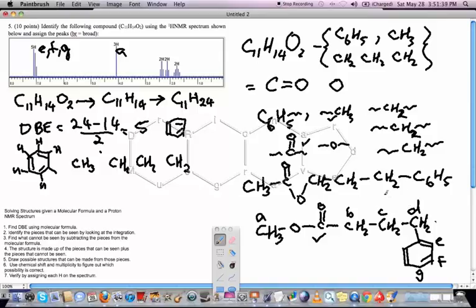Now we've just got to figure out these guys here. Now what I like to do is, when I'm looking at these, I will often figure out what's going on with the multiplicity. So we look at the C, and we see that this C, CH2 here, has, it's going to be this one here, because this has 5 peaks, and it's got 4 adjacent hydrogens. So this one's going to be C. And the other two are going to be B and D. Now this is going to be a little bit of a toss-up, but I'm going to say that this one is B, and this one is D. Now both of these groups, the C double bond O and the aromatic ring, are having an effect on these CH2s, and pushing them a little bit downfield. But since the B is closer to a C double bond O, which is likely to have a bigger electronegative effect than the ring will, I'm going to go ahead and assign this one as B, and I'll assign the other one as D.